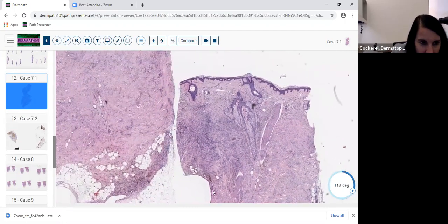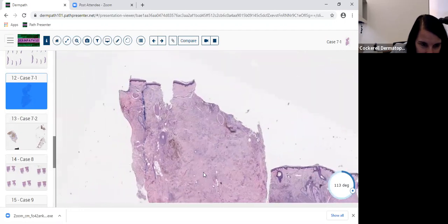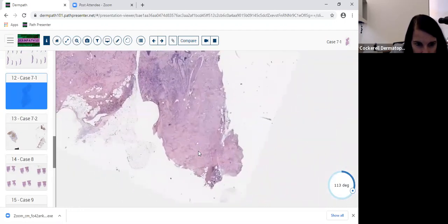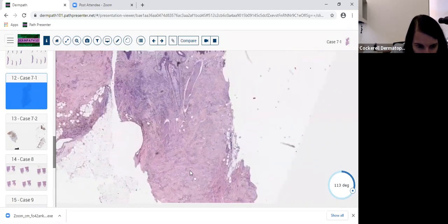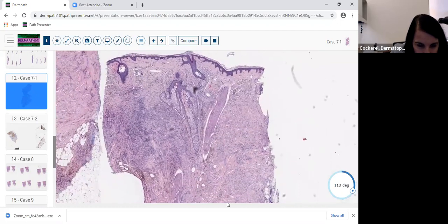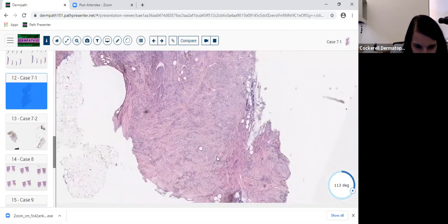Here's a beautiful case. It's obviously something's really active in this punch biopsy. There's a process going on that has taken over the upper dermis, the mid dermis, the lower dermis, and into the panniculus.